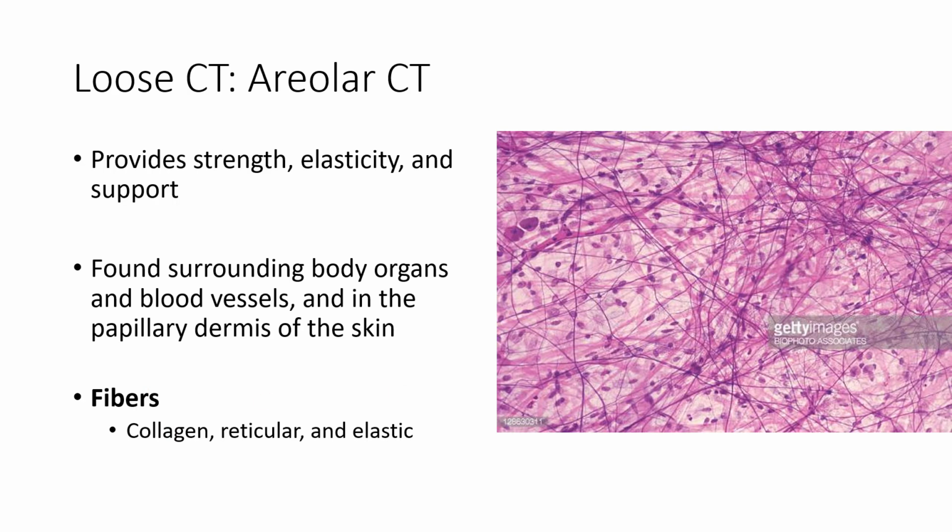Now, as we did in our first lab, I'm going to be focusing primarily on how we recognize these tissues, not so much on where we find them and what they do. Now, as I mentioned, fibers often give us a hint as to what the tissue will do.